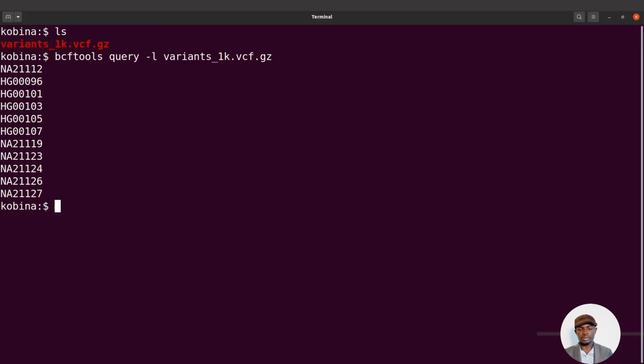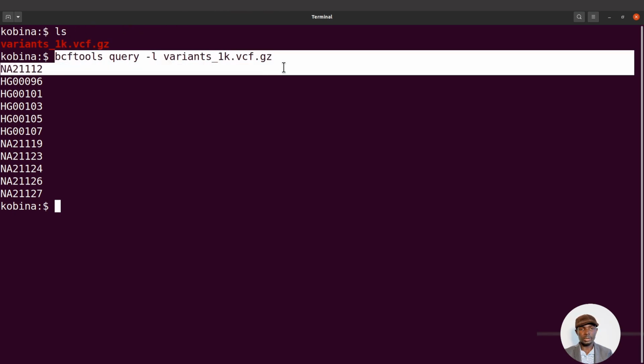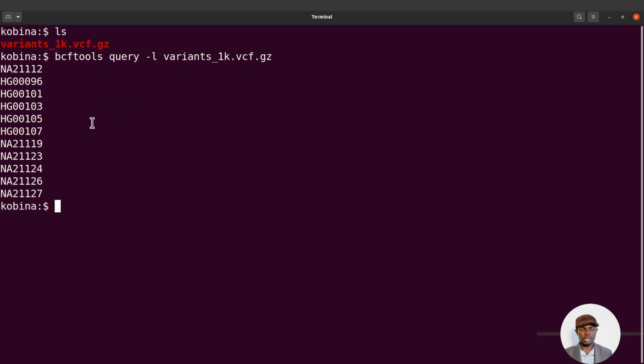So let's look at it. To use the +split, you also have to specify a file which has the samples you want to split. All right. So that's what we need to do next. We are going to reissue this command again, and then we are going to place all our files in it. I mean, not files per se. We are going to place all our sample IDs in it, and then we will use the BCFTOOLS plus split.